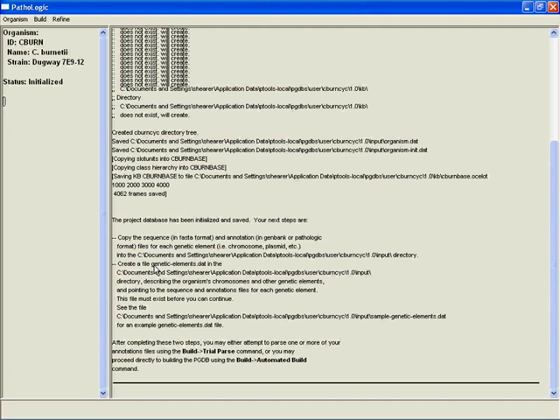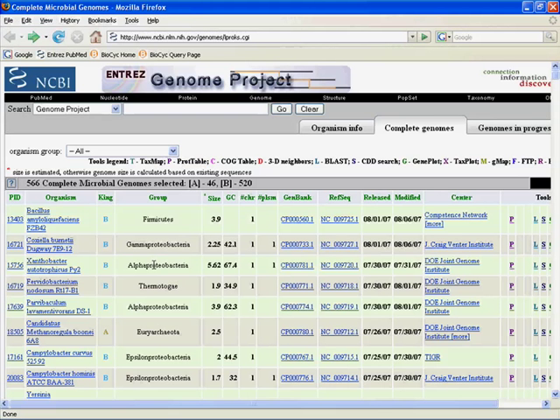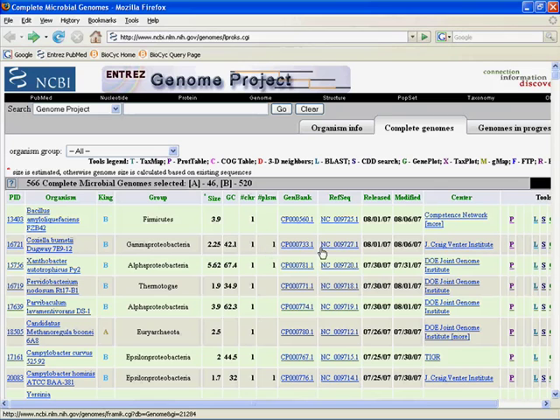So we're going to start by downloading the GenBank and FASTA files that we need to make this database. So let's skip back over to the NCBI site. Once again, here we are in the NCBI site. I am just going to go through and click through on the RefSeq link.